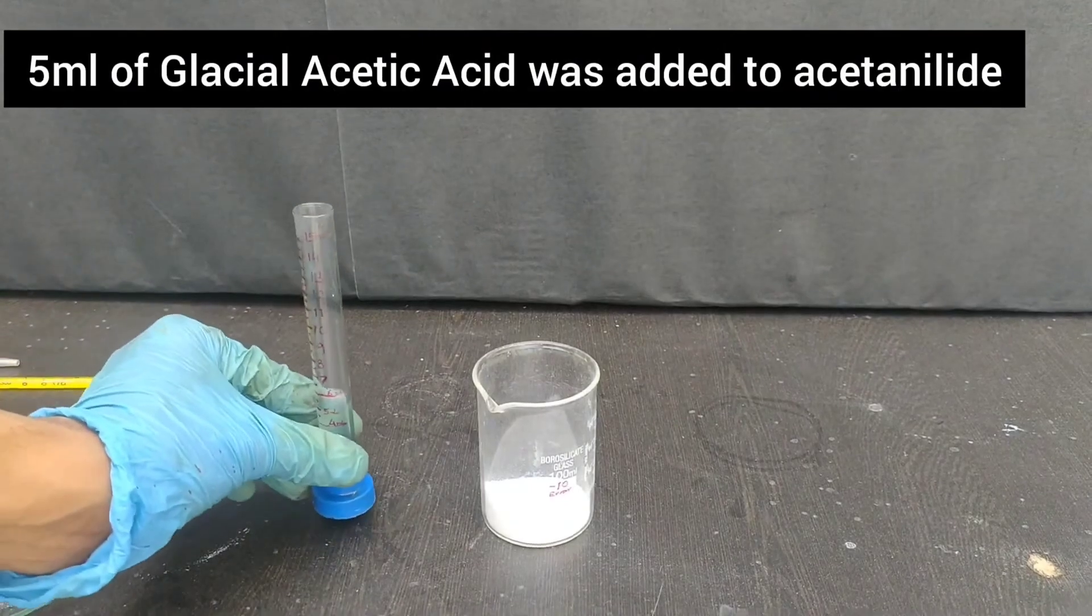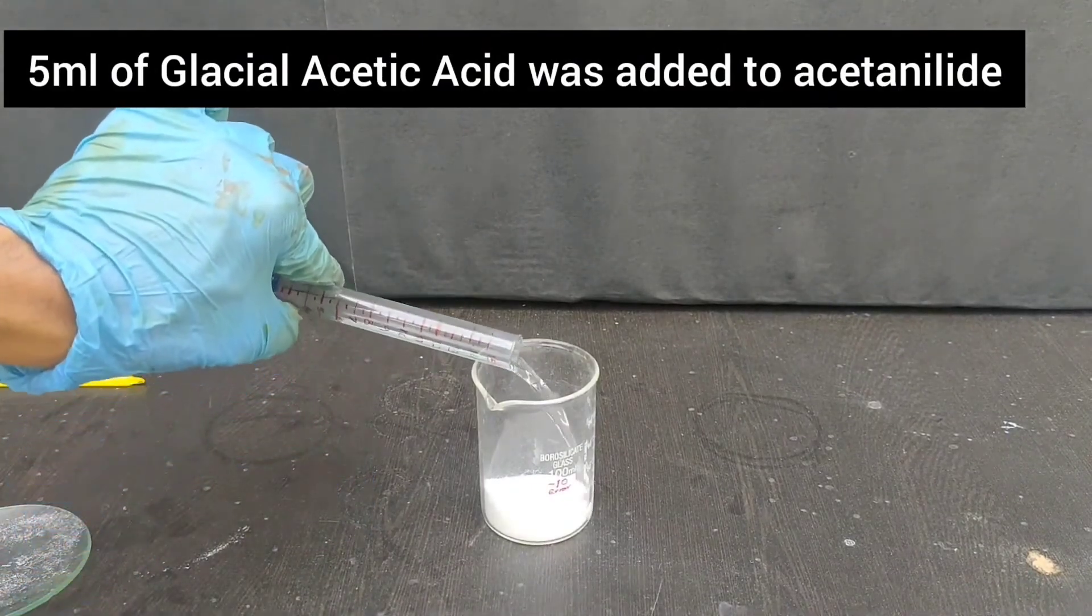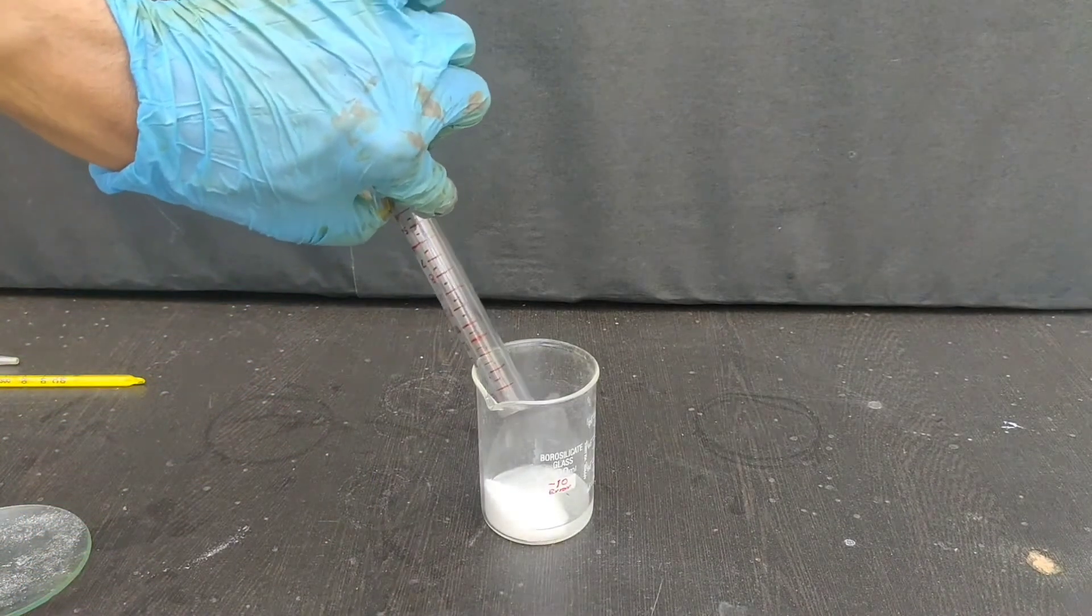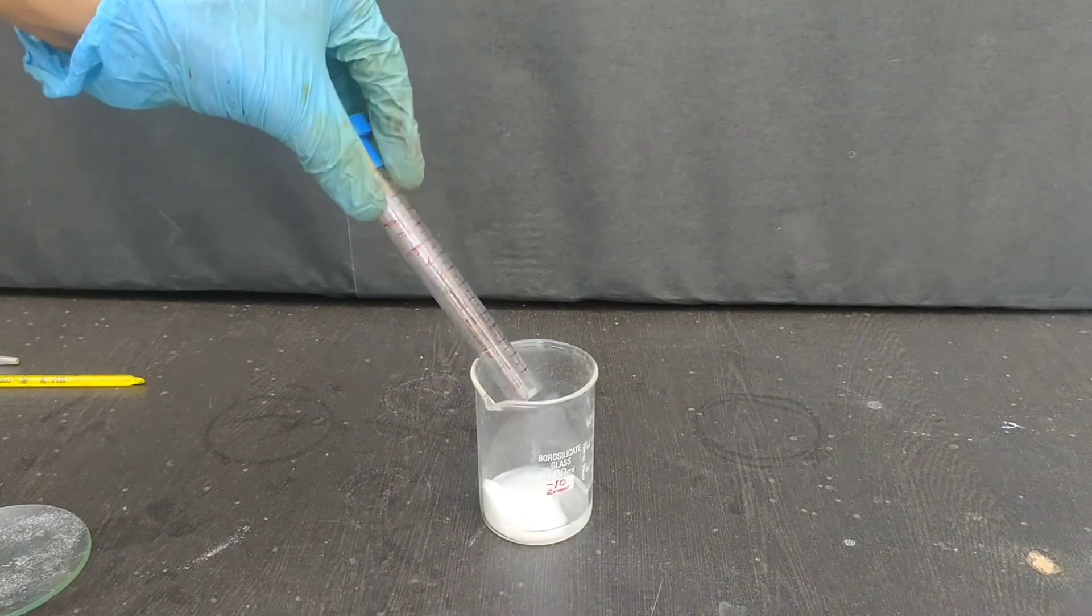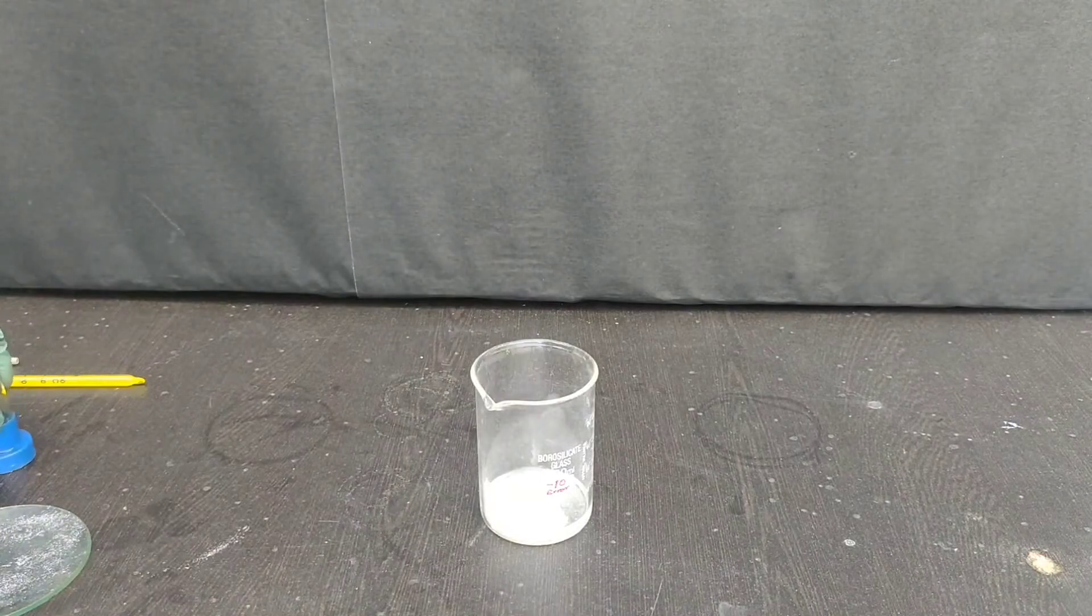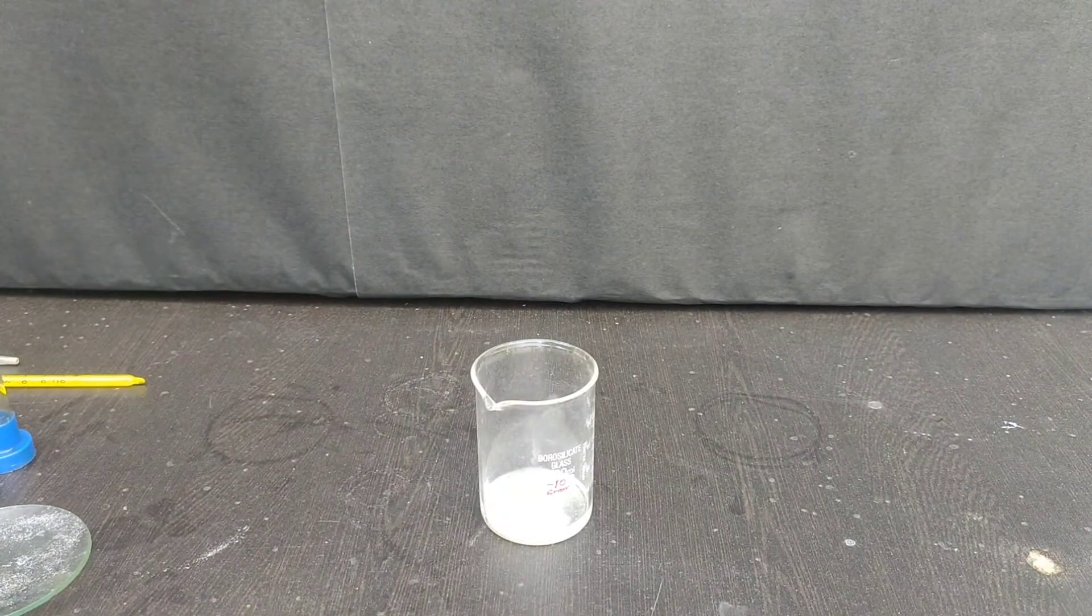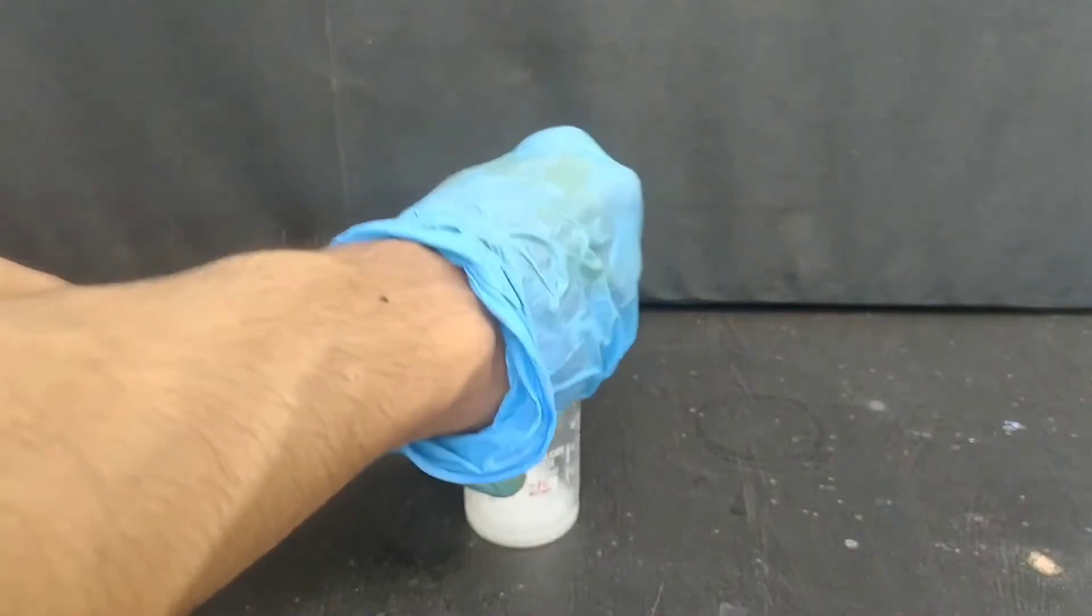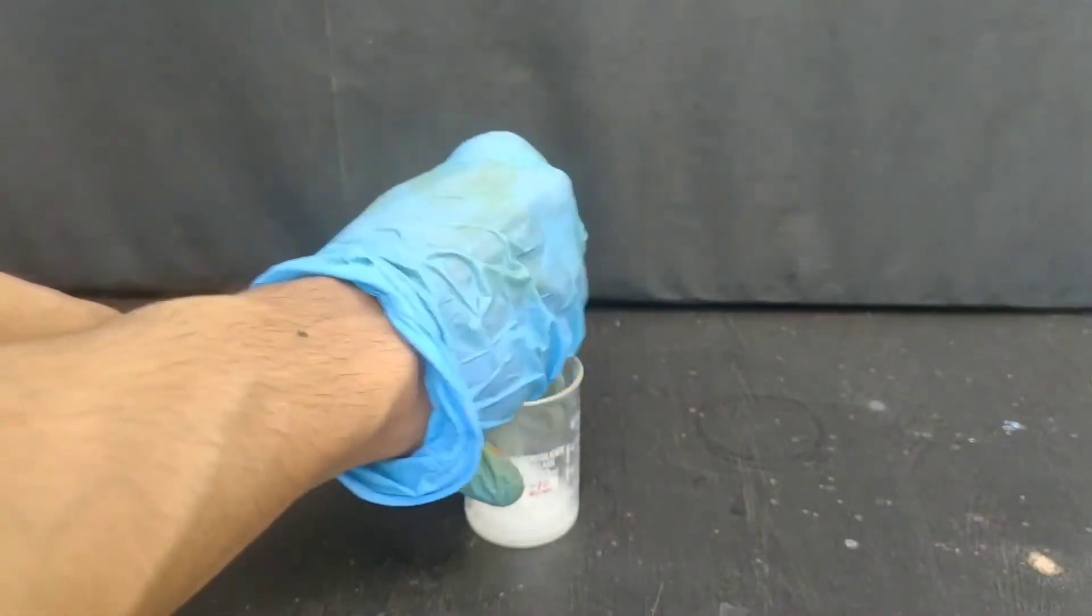To the acetanilide, I will be adding 5 ml of glacial acetic acid. Glacial acetic acid is used to prevent hydrolysis of acetanilide by shifting the equilibrium to the left side. Dissolve it well in glacial acetic acid.